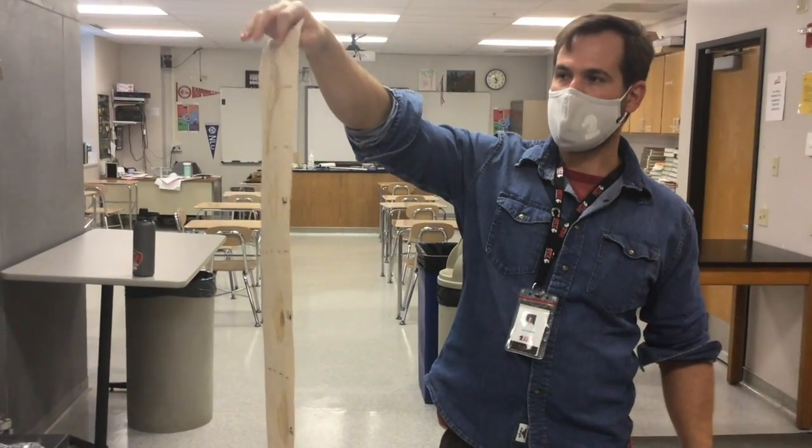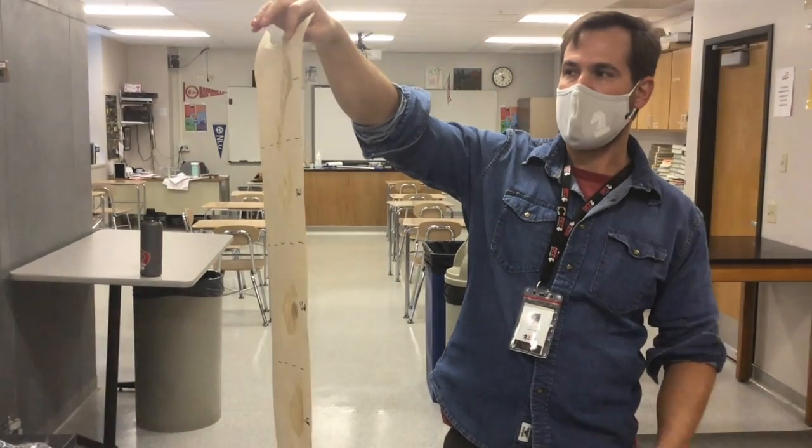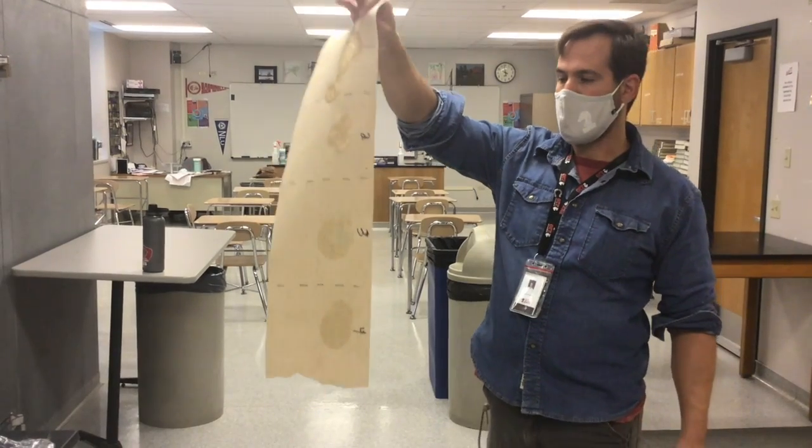It would look like when you get a bag of fast food or something where the bottom of the bag gets all that grease and fat on there. So that's what you're looking for with this test.